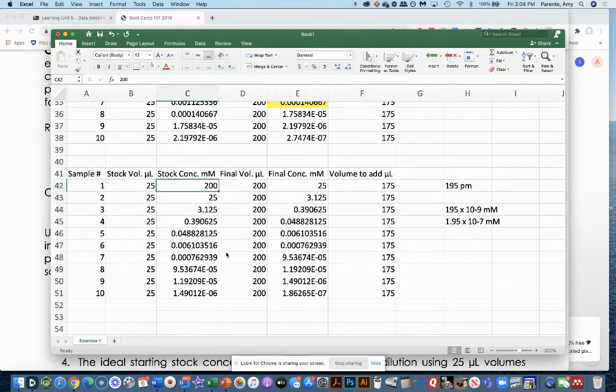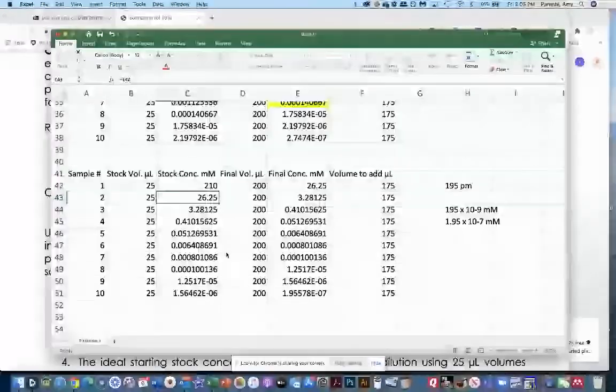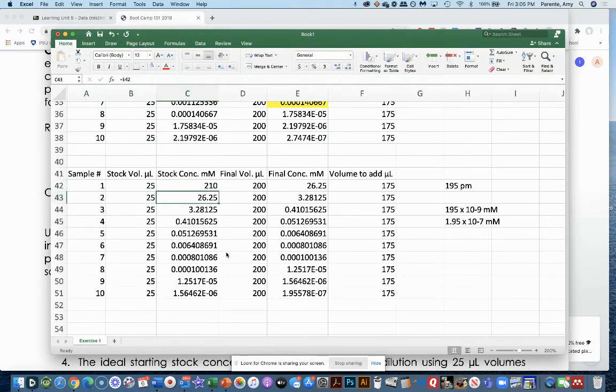And I'm just going to keep narrowing the gap here. What about 225? Oh, that's too much. 215. Ooh, we're getting close. That's 200 picomolar. 210. Ooh, that's pretty good. And again, if I want to have something that only has 3 significant digits, let's check out 209. I guess that could round up. How about 211? That's too much. 210? That might be pretty good. Maybe 209.5 is going to be almost exactly right. But if I wanted something that had 3 significant figures.